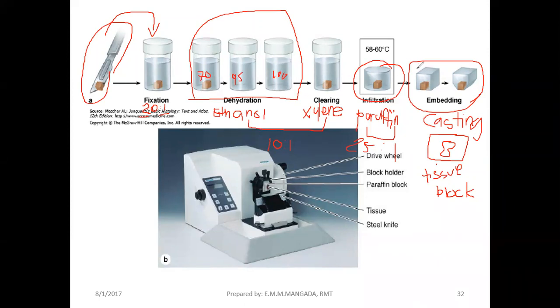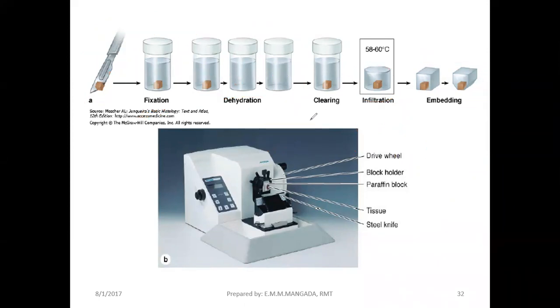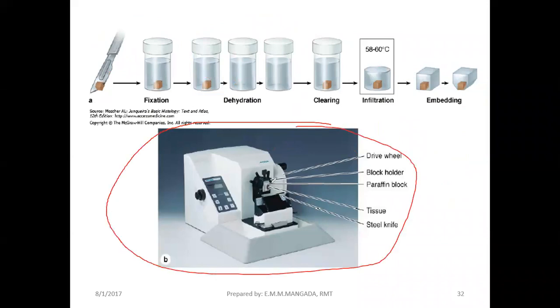So guys, here naman is a picture of a microtome. So this is where we do the cutting. Napansin nyo, this one is actually the tissue block. And it's actually fitted dun sa ating tissue holder. And this one naman holds now our knife. Ito yung knife niya. And this one, guys, parang wheel ito. Ito yung handle niya. Iniikot-ikot natin yan.